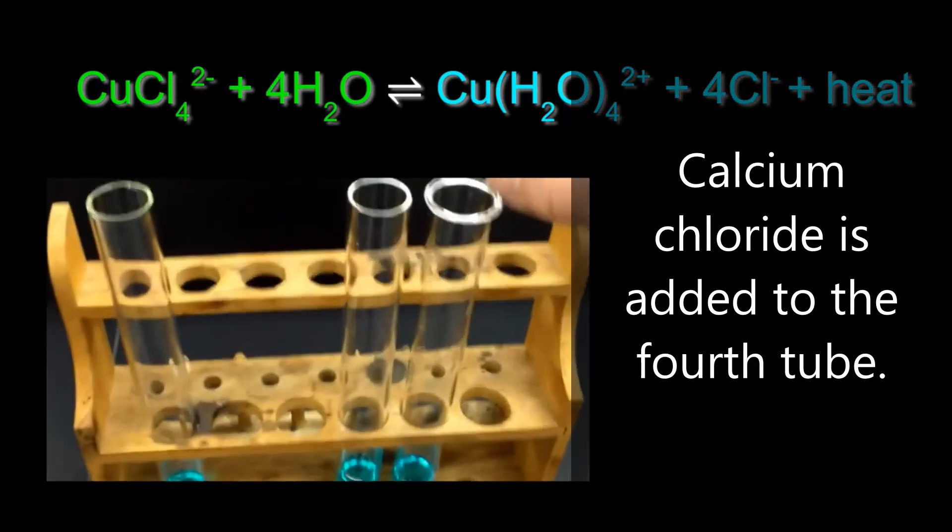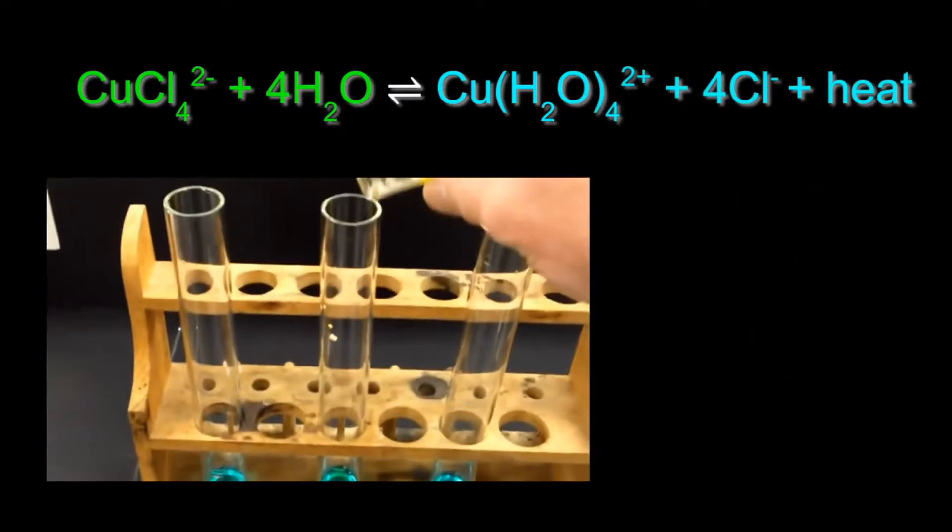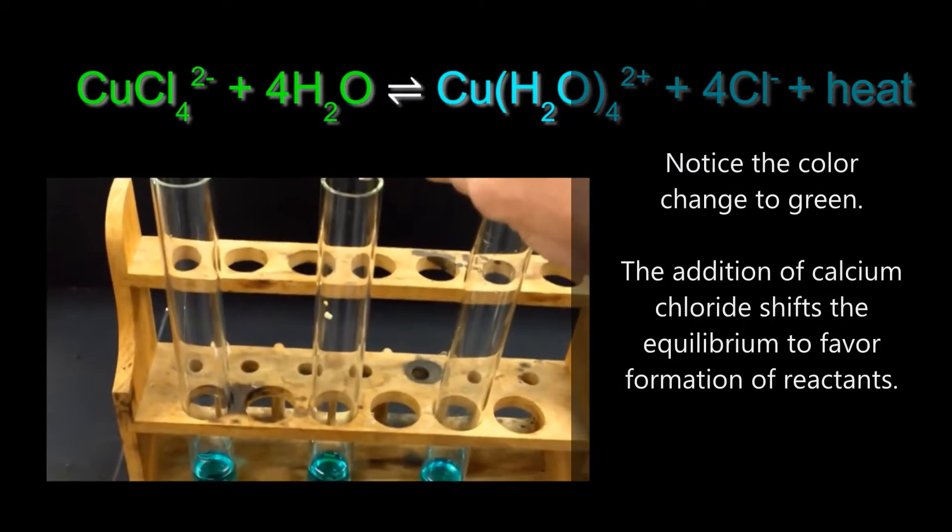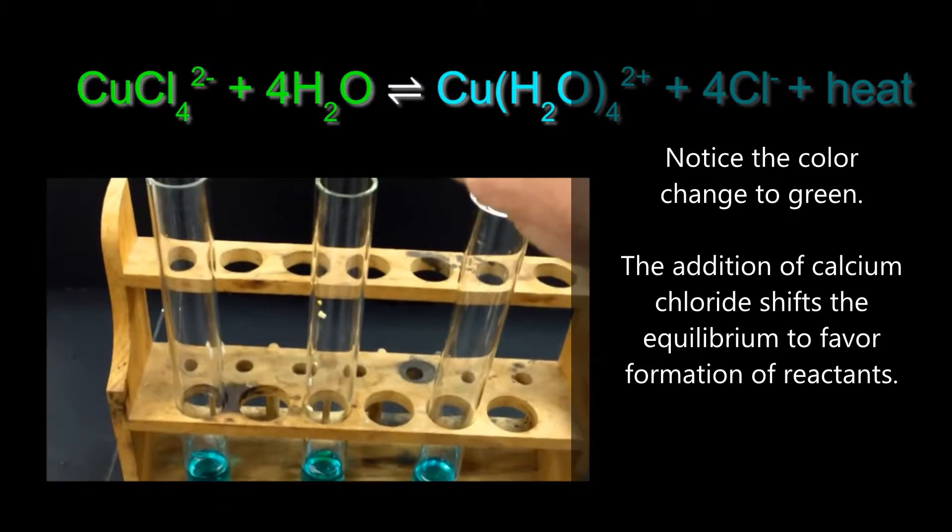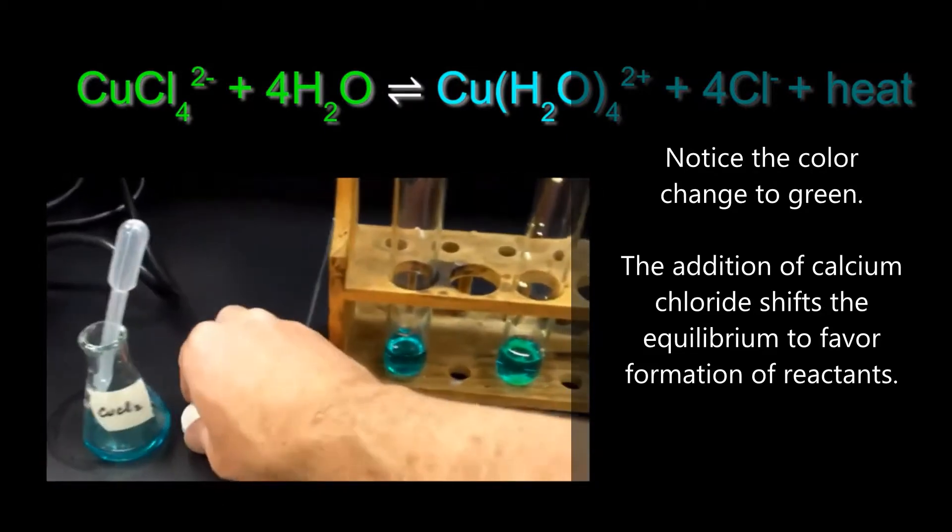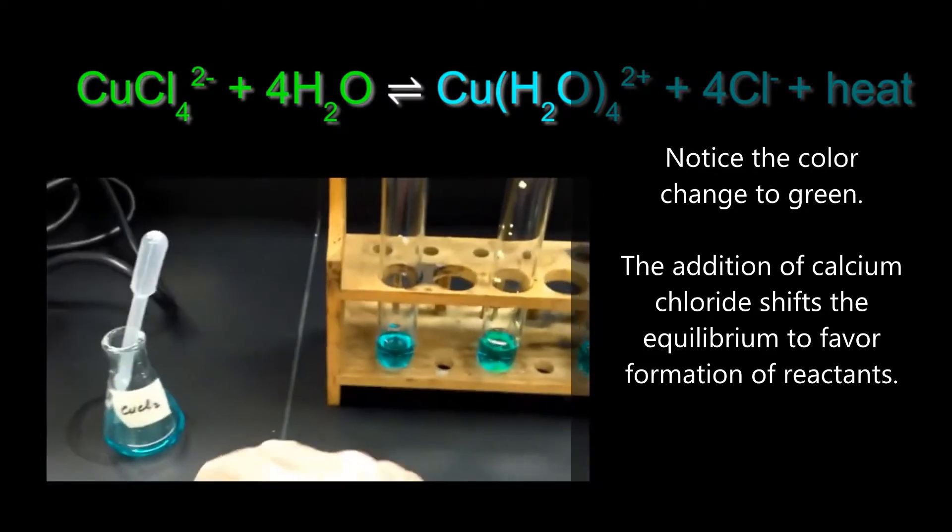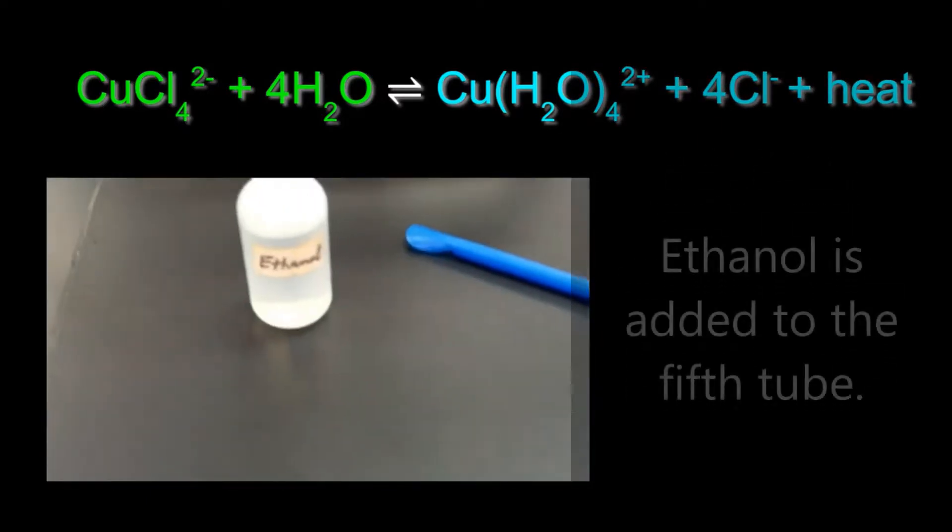Solid calcium chloride is added to the fourth test tube. Notice that the color of this tube starts to turn green. This is because the addition of the chloride ion shifts the equilibrium position.